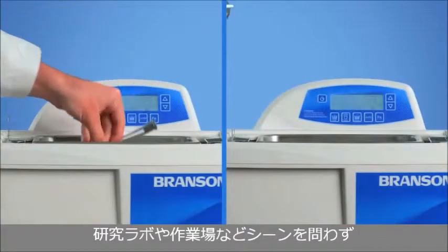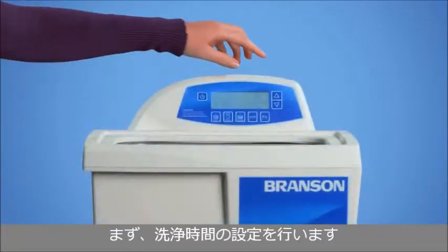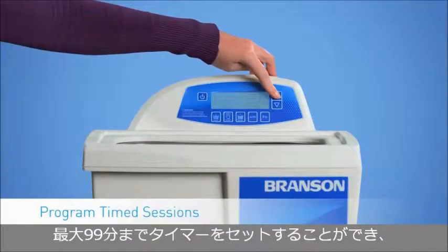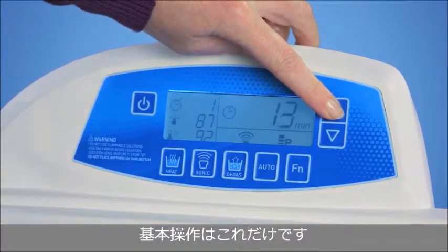From the laboratory to the workshop, the new CPX series offers the right settings for the right job. Start by setting your cleaning time. You can choose timed increments of up to 99 minutes, or get the flexibility of continuous cleaning with a constant sonics mode. Either way, just set your digital Bransonic and forget it.